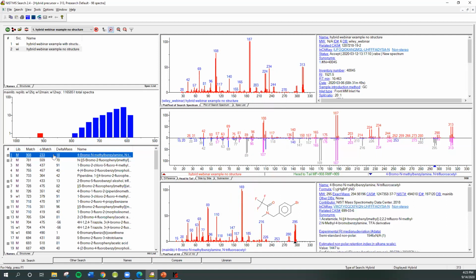Well, so you have to start thinking about what 18 means. We knew in the substructure a minute ago that it had fluorine. So what I really think would be the best guess is, if you look at the structure down here, one of these hydrogens is no longer there, and you put a fluorine on the ring. So I'm pretty sure from these results that that's a really good candidate for an identification. So you have to decide where it might be. Well, that's not really easy to do with mass spec.